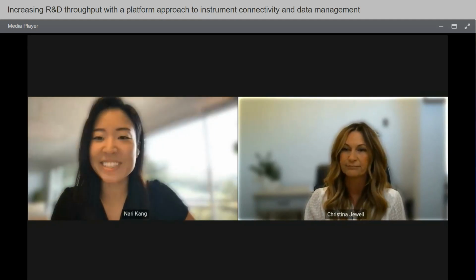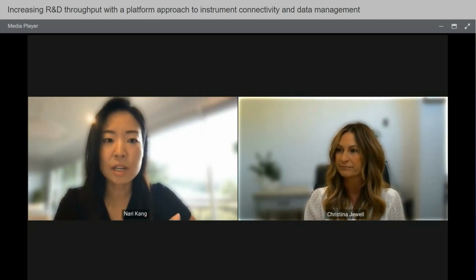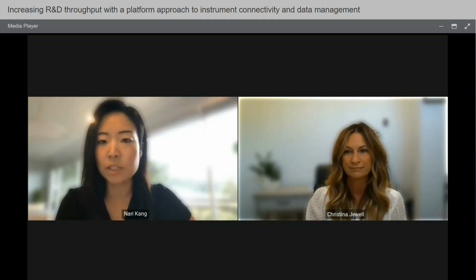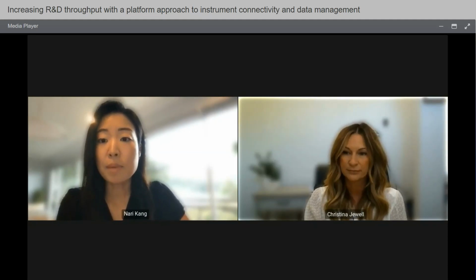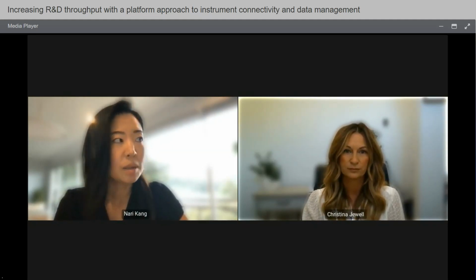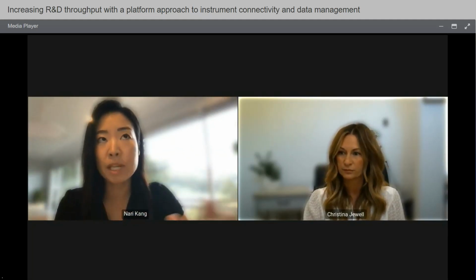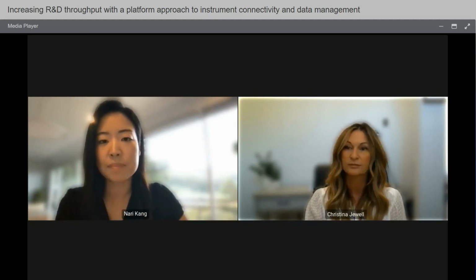Yeah, that's a great first question. So as I mentioned in the presentation earlier, Allotrope is backed by many of our major pharma companies and industry vendors, such as Thermo Fisher, Agilent, Waters, and so forth. Many of our customers know and have already supported Allotrope. Historically, Allotrope has been focusing on their own proprietary data model, which made it a little difficult for customers and us to adapt.